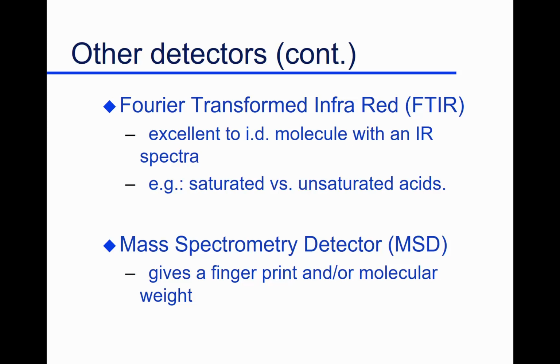They were good for some compounds, but we just found other ways to deal with that. So if you ever hear of FTIR coupled with GC, not anymore. This is what's been the major change in detectors. They're starting to use mass spectrometry as a detector. You'll deal with that as a subject. We'll talk about mass spectrometry in itself, but here we're coupling it to a gas chromatograph.